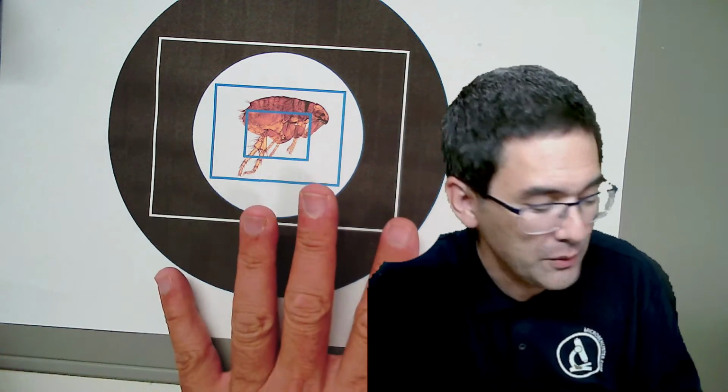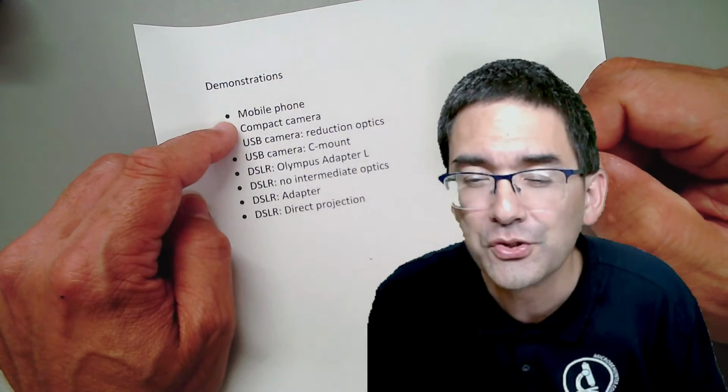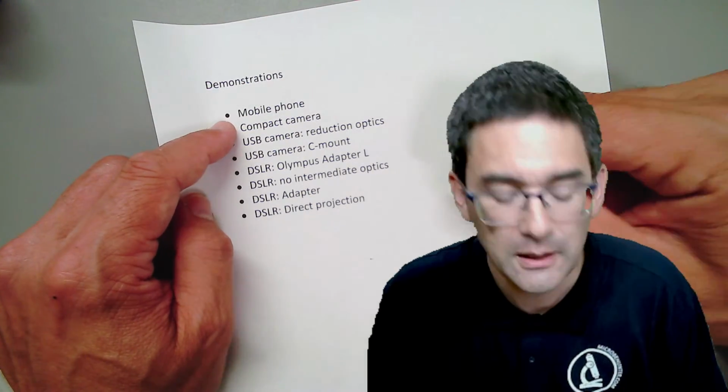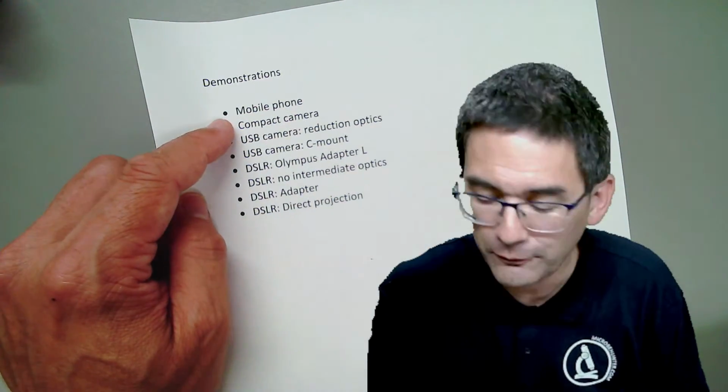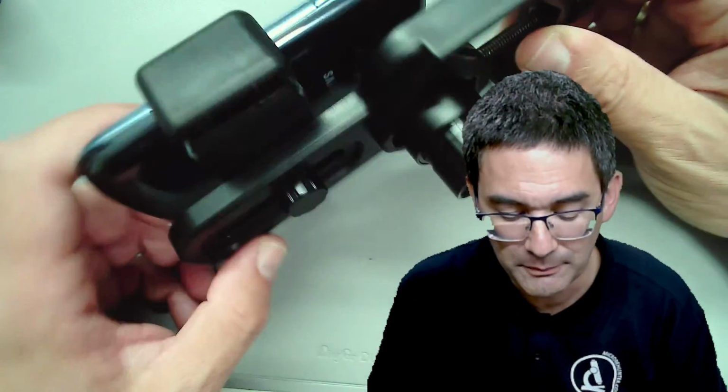So what I'm going to do now is go through my list here that I made myself, so that I'm not going to forget about anything. I'm going to first talk a little bit about connecting mobile phones. How do you connect mobile phones? Well, pretty much everyone these days has a mobile phone, and as a matter of fact, some people even have old mobile phones that they don't need anymore, like, for example, this one over here.